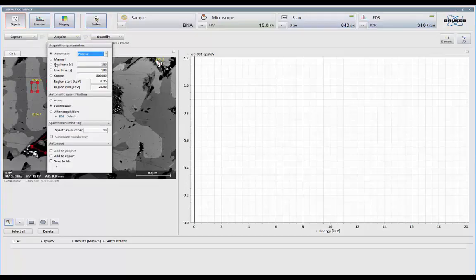You can do it manually, which means keep collecting until I tell you to stop. Real time, live time, counts within the user-defined region of the energy axis, and that region could be anything you want to set it up to be.